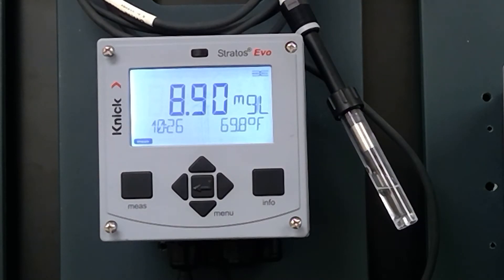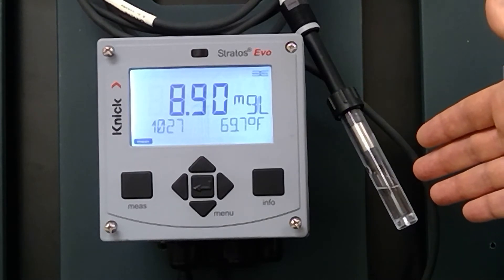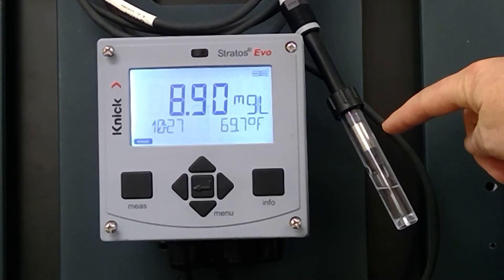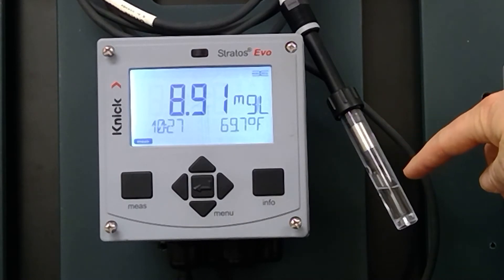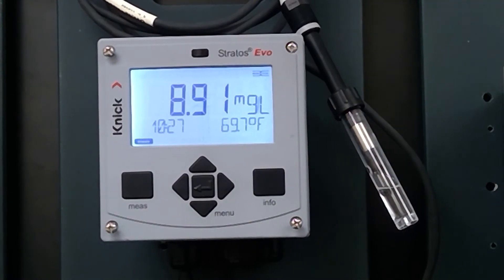Right now we're reading concentration, and what we want to do is go ahead and start the calibration. Before you do that, just like in previous videos, you want to take the calibration beaker, fill a little bit of water in the bottom, then install the DO probe but don't immerse it in the liquid. Leave it there for 15 to 30 minutes, and what will happen is you'll create a 100% humidity environment — I'll explain why that's beneficial.